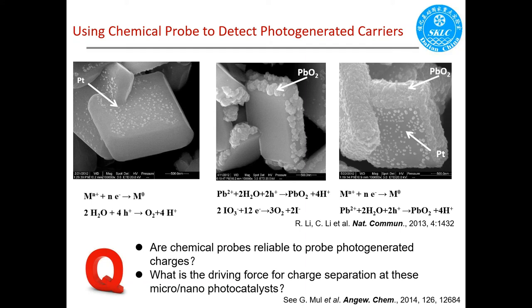However, many people challenged this experiment. They are trying to find other evidences. One of them, Professor Guido Mul at Twente University in the Netherlands, found that it might be possible that the preferential adsorption of these chemical probes might be a reason why you see these phenomena. So we are trying to figure out whether his answer is right or wrong. Another question we want to figure out is what is the driving force for the charge separation at these micrometer-level particles? So now with this technique, we have the opportunity.